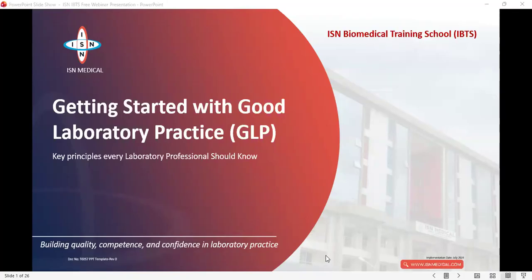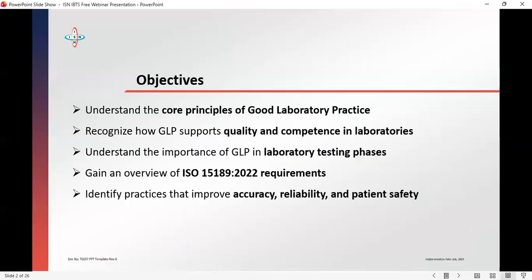Yes. Joy said it is possible for a test to be technically correct and still be wrong based on wrong data capturing, having the wrong data for the test being run. Exactly, wrong data for test running, yes. That's another aspect of it, right? This is something we see happen more often than we like to admit. These errors always happen often in the laboratory.